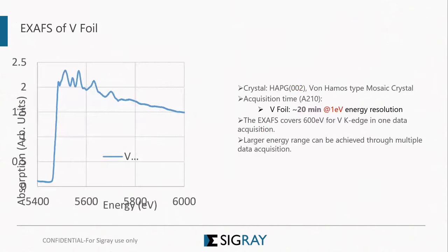And the next one is EXAFS of a vanadium foil recently measured, and it takes about 20 minutes to measure the EXAFS spectrum over a fairly large energy range. So those are the examples we have been doing, and we welcome whoever is interested to send samples to us, and we do the measurement.